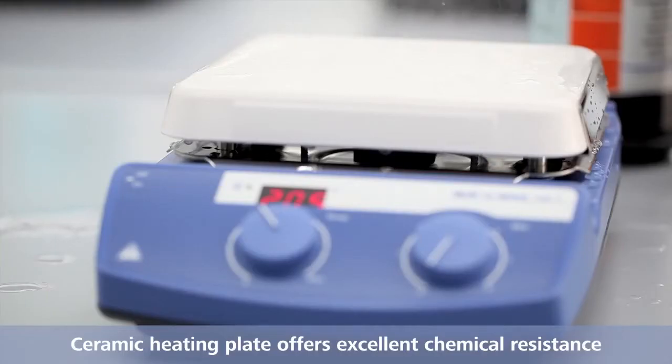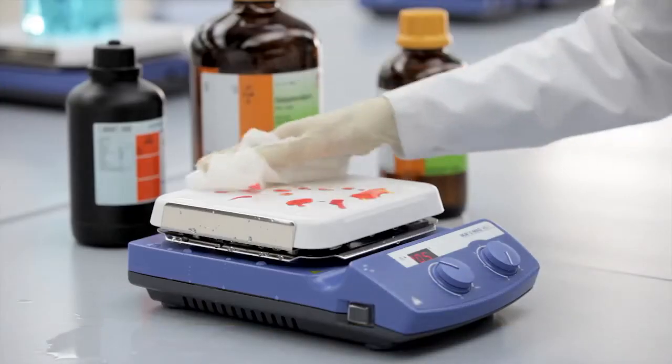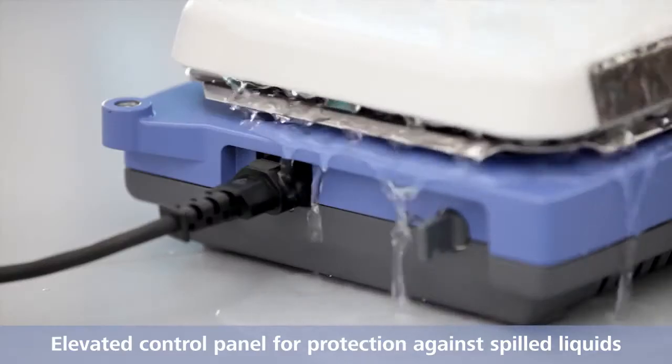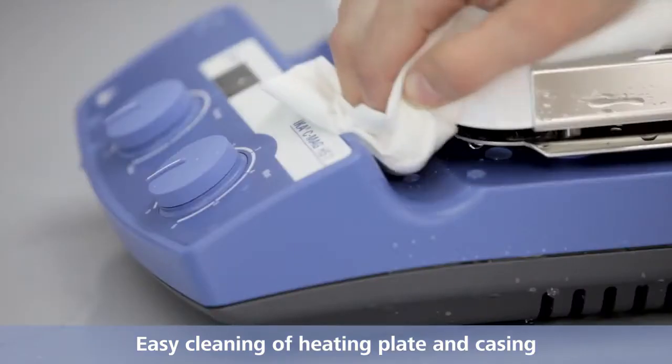The ceramic heating plate offers excellent chemical resistance. The elevated control panel protects the display from spilled liquids. Easy cleaning of heating plate and device casing.